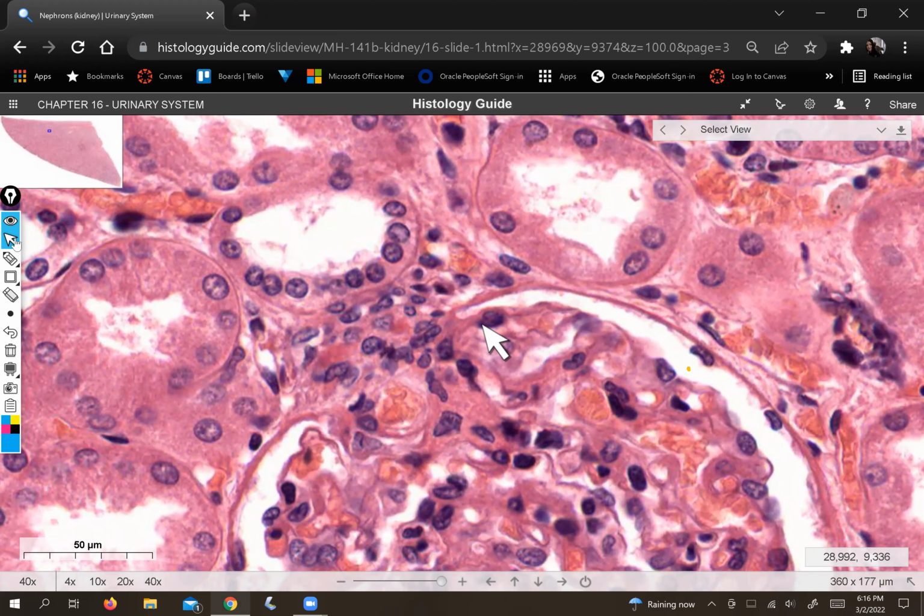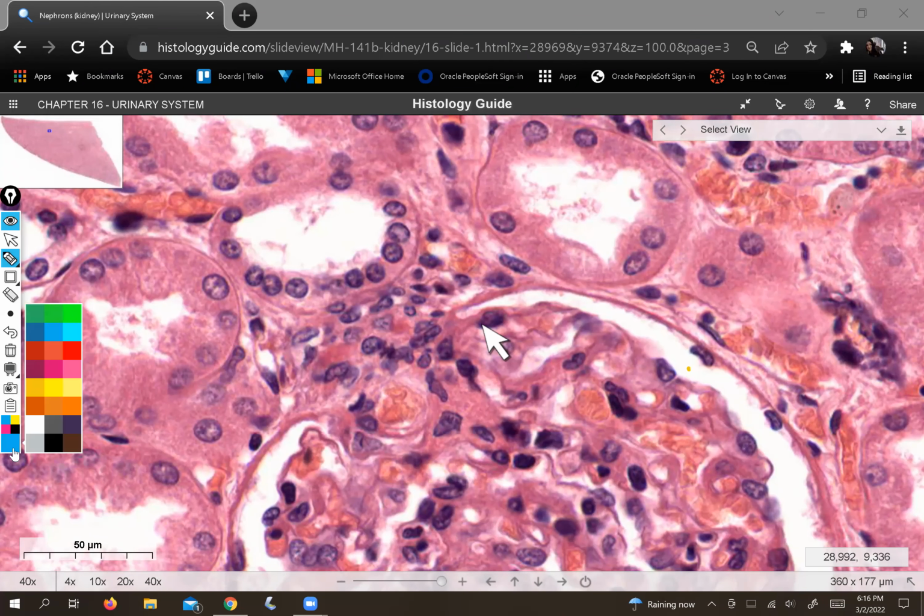So what you'll notice, and this is a good skill to get in the habit of in general, is when you have a tube, sometimes the spacing of the cells will be not uniform around the tube, and that's true here. So we can see that the internuclear distance is pretty wide in some areas. But then once you get close to the juxtaglomerular cells and close to the side of this tube that's facing the corpuscle, we get lots of nuclei very close together. So they're touching each other in some cases.